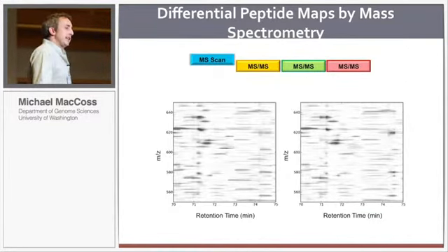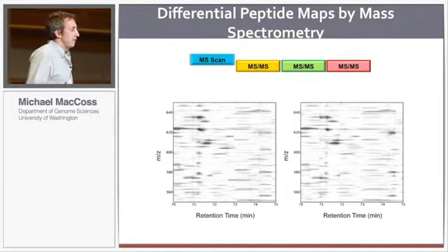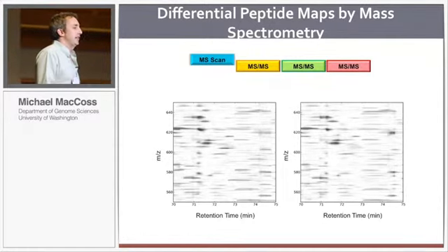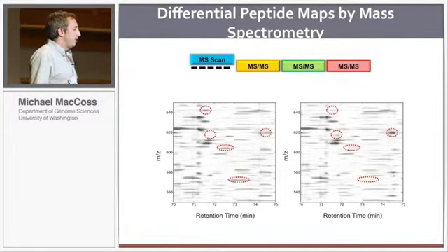So one of the things I've always wanted to do is, actually, I've never really been that interested in how big a list of peptides I can identify or how many proteins I can identify. What you really want to know are the important things to be able to track, and you want to be able to follow and make comparisons between samples. So you can easily do these sorts of experiments.